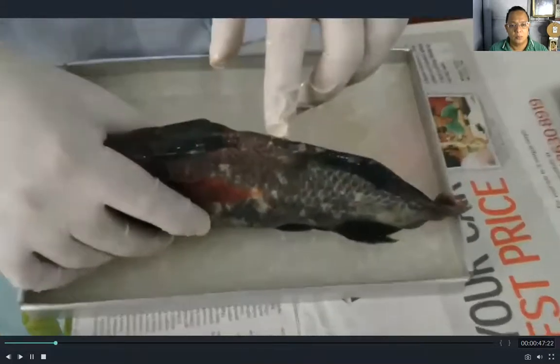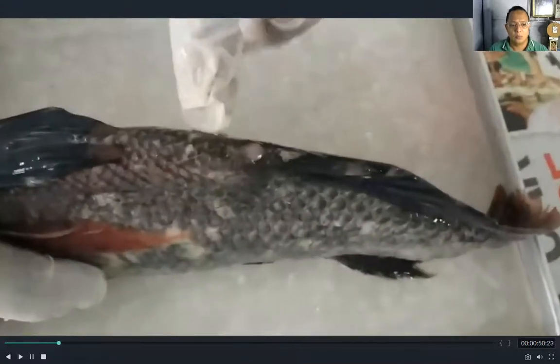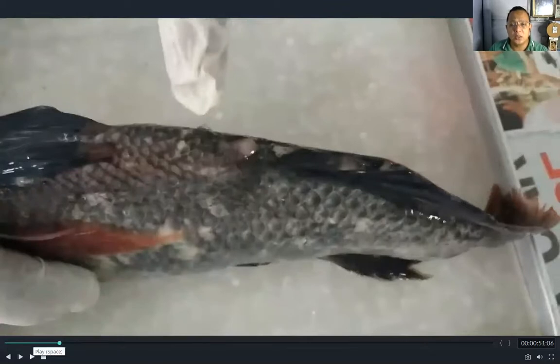So this is the anus of the tilapia. The discussion covered some of the external parts of the fish, namely the operculum — what you call a gill cover — which is a bony structure that protects the gills. He also discussed the different fins of the fish, which are used in swimming, for movements such as balancing and turning.